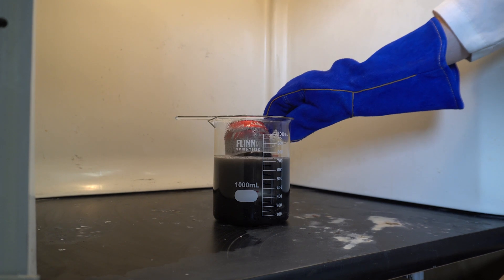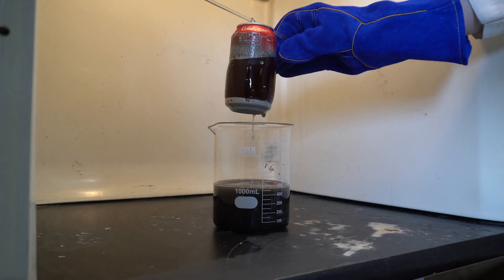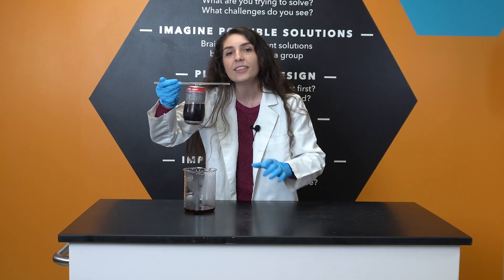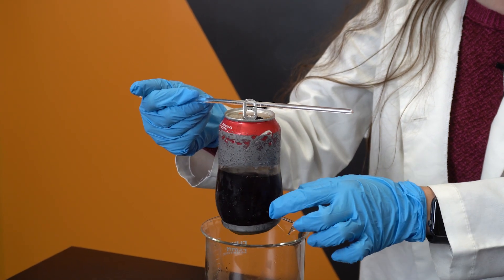Let's take a look and see if the soda is still in place. The aluminum can has mostly dissolved in the sodium hydroxide solution, but we're left behind with this. This is a thin plastic lining that coats the inside of our beverage cans.